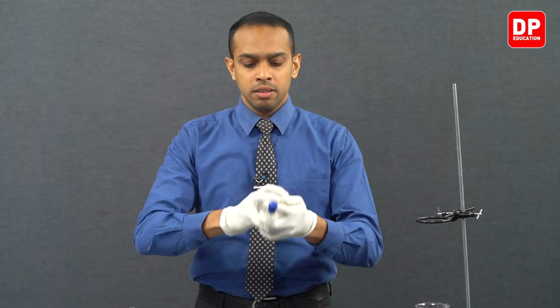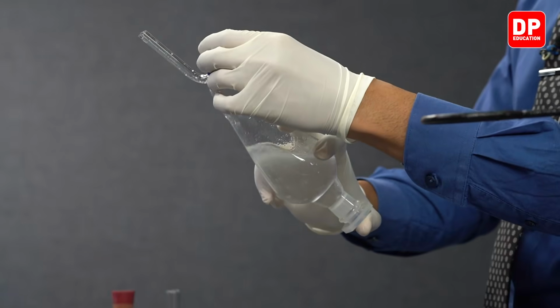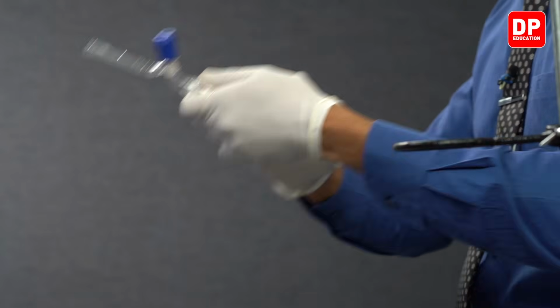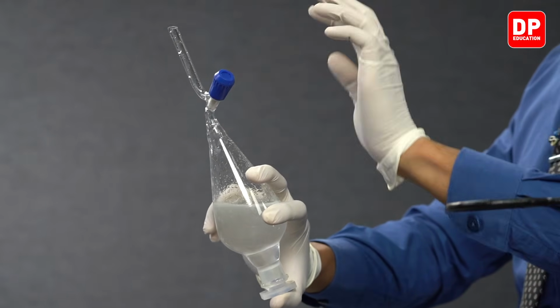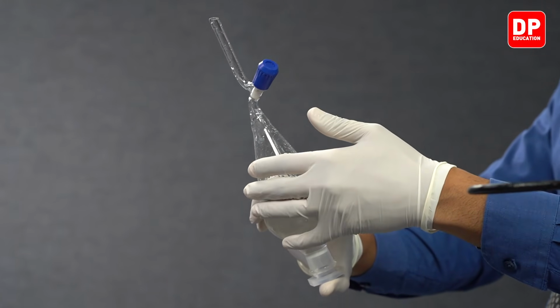After adding the 10 cubic centimeters of diethyl ether, we'll continue to shake it, but when you're shaking it, please make sure to close the stopcock tightly and then mix it really well. After that, to relieve the pressure, you can open the stopcock and release the pressure that is built inside the separating funnel.